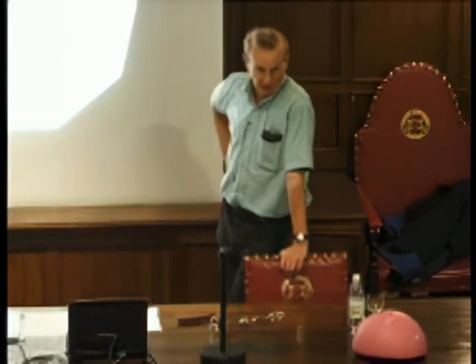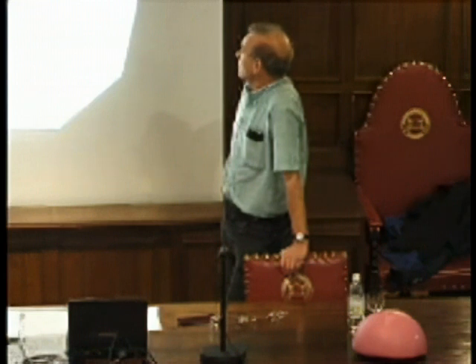and we go into the world of the very small, which is a world that often you think is beyond vision, but I would say it's beyond normal vision. We can't see anything with our eyes that's smaller than about a tenth of a millimetre or a bit less than that, 10 to the minus 4 metres. Now, compare this with the size of bacteria, which is about an order of magnitude or so smaller than what we can resolve with our unaided eye. You need to have instruments to do that.